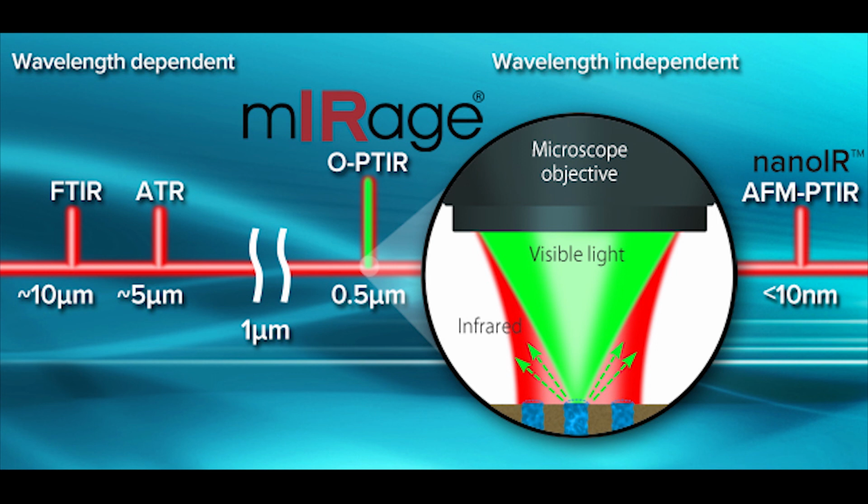thermal property differences. So what we typically recommend is taking multiple images at different wavelengths, because when you change to different wavelengths, you can then create a ratio image that will normalize out all of the differences in the thermal properties, such that you're just seeing the differences in the IR properties. And that same thing is true when we do a spectrum. When we're doing a spectrum, the only thing we're sweeping is the wavelength. So all of the thermal properties remain constant, and so the features that you see in the spectra are due exclusively to the changes in IR absorption in the sample.